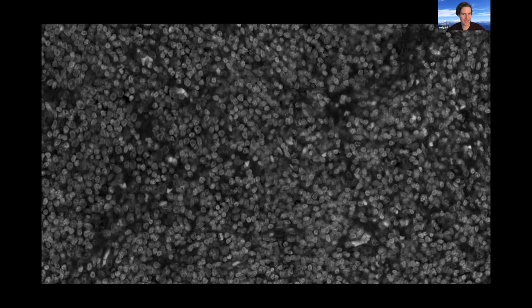You probably want to highlight those cases in the final result too, because that would be nice to have. But currently we haven't done that. There are methods that try to fuse several annotations. So these things exist, but typically people don't even have the time to do one annotation of the data, let alone several, because it's just too much work. But if you really cared about that, you could do that.